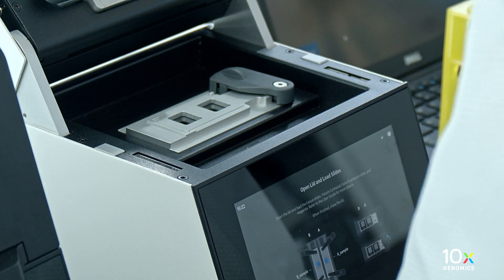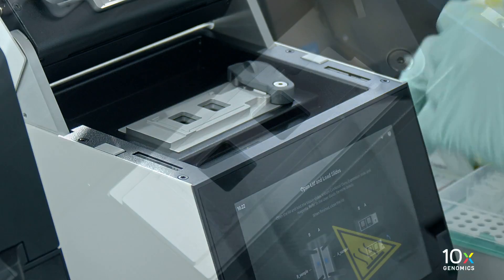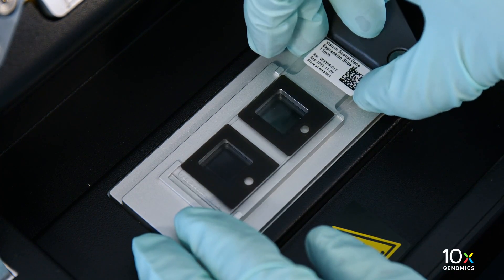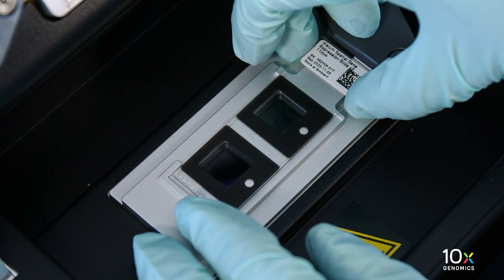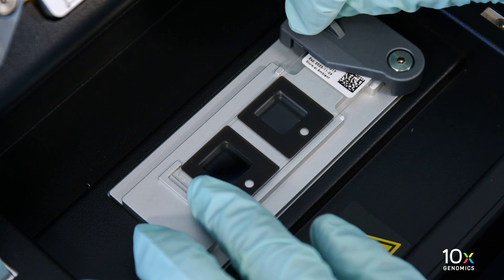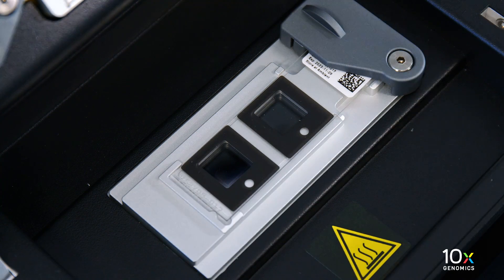Open the Visium slide lock by using one finger to pivot. Line up the slide with the label face up and oriented to the right. Fit the slide within the raised grooves on the left, top, and bottom. Hold the slide in place with one hand while slowly closing the Visium slide lock. The lock will partially obscure the slide label when correctly secured.